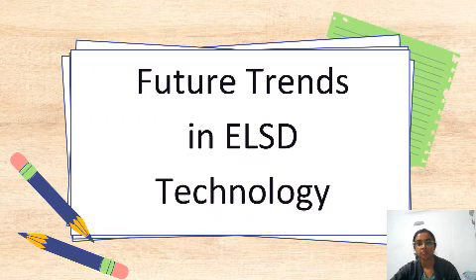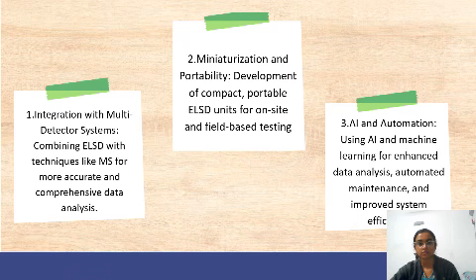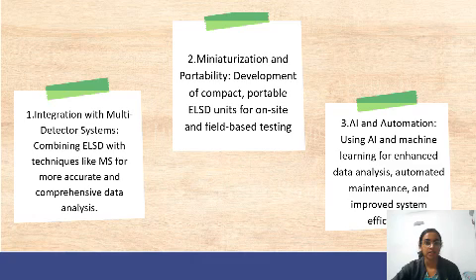Let's see the future trends in ELSD technology. First one is integration with multi-detector systems, combining ELSD with techniques like mass spectrometry for more accurate and comprehensive data analysis.